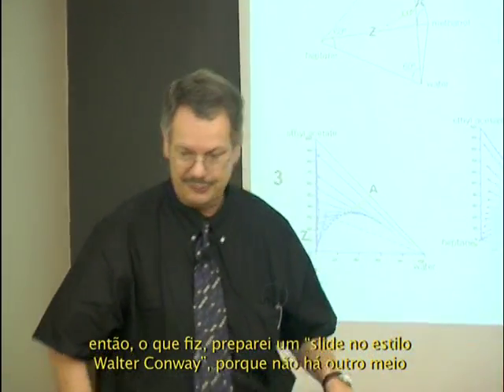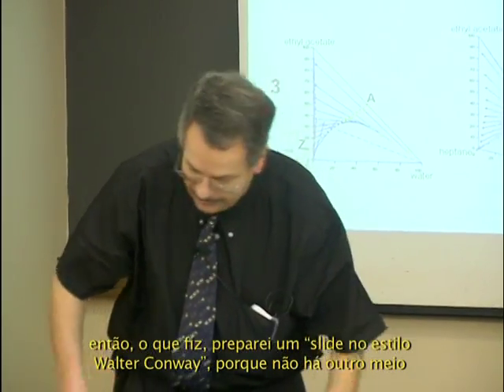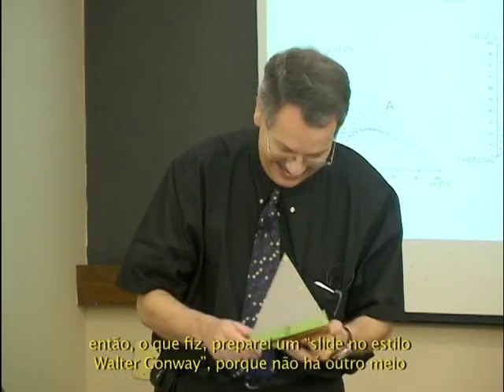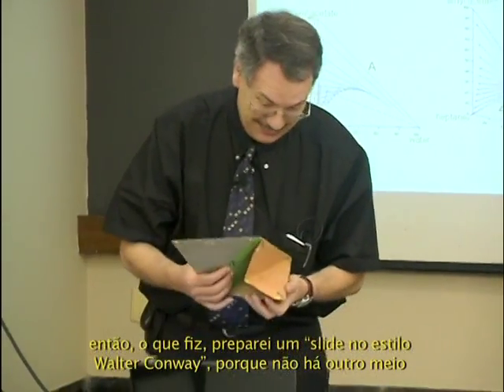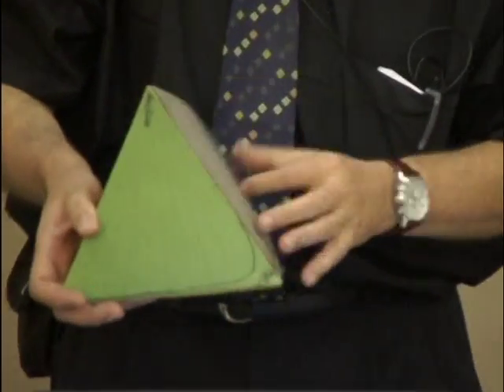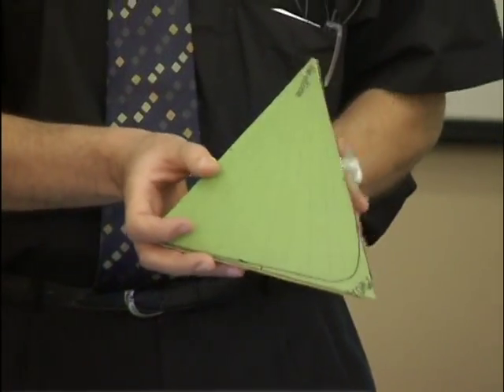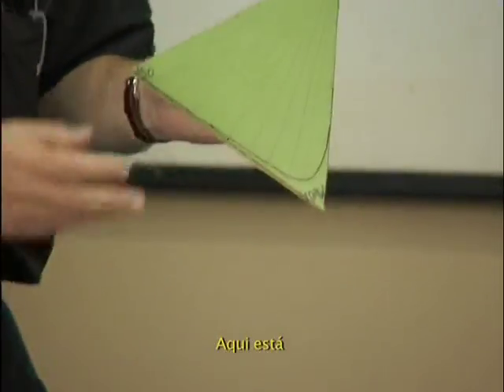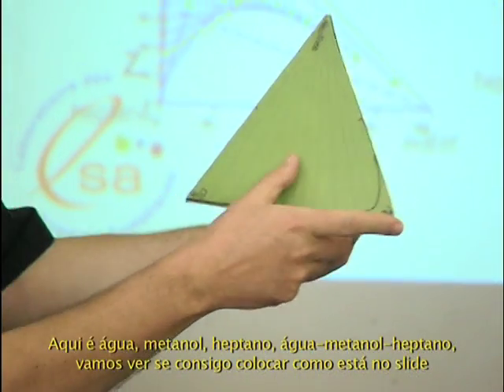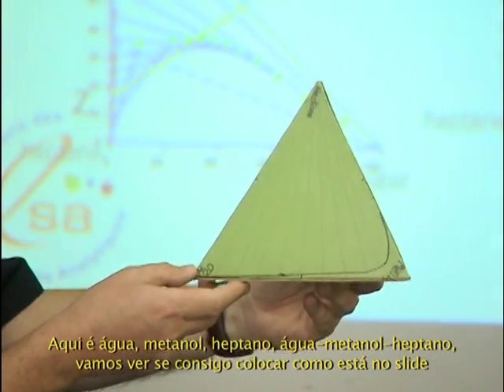So what I did, I prepared a Walter Conway style slide, because there is no other way. This is it. So let's see, water, methanol, heptane.